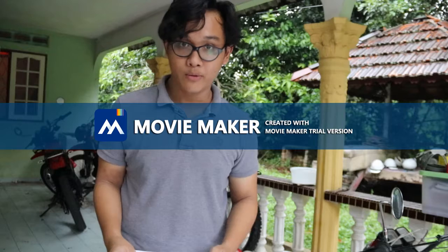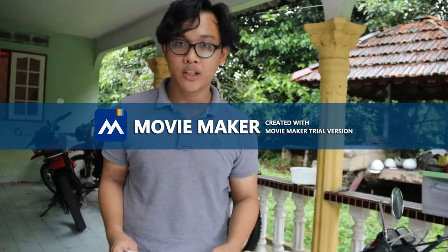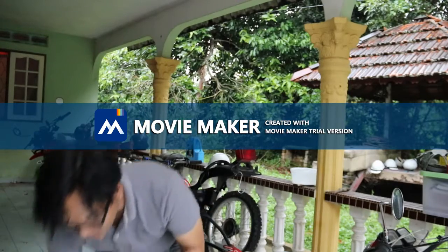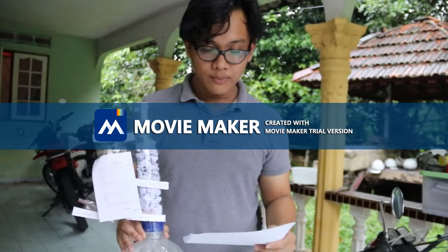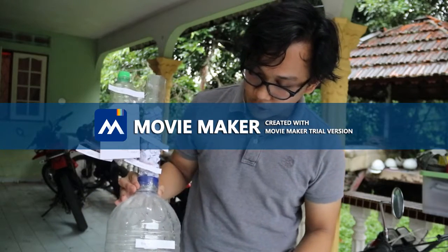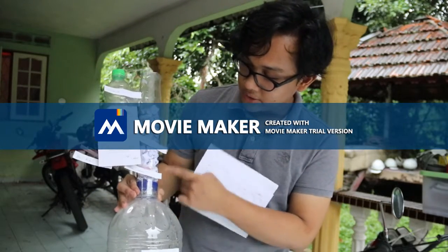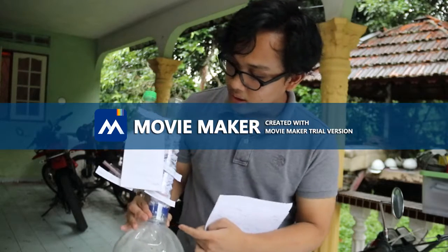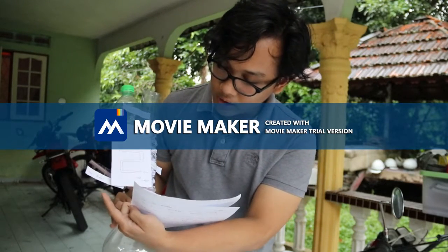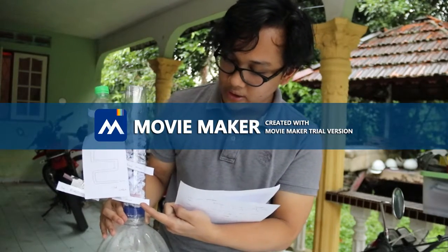My name is Muhammad Ashraf. I will be presenting the prototype. So this is the prototype for the packed distillation column. This is the boiler, and this is the packed column, and this is the condenser. This is where the pure alcohol is extracted, and this is where the reflux returns.